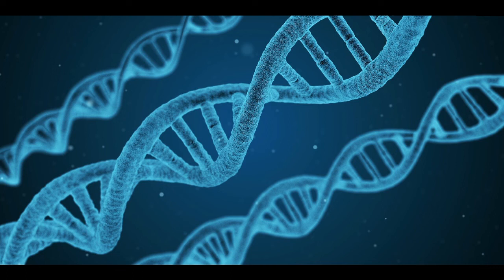Not every sequence is. Oh, I see. When you put in your list of base pairs, it's only going to match that size piece in what's in Genbank, and so you may not be matching against the whole ITS region of other things that have been sequenced. Right, but it can still be valuable and useful. It's a little bit different.